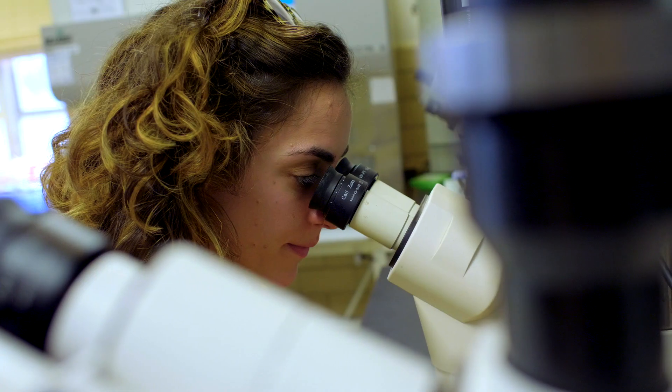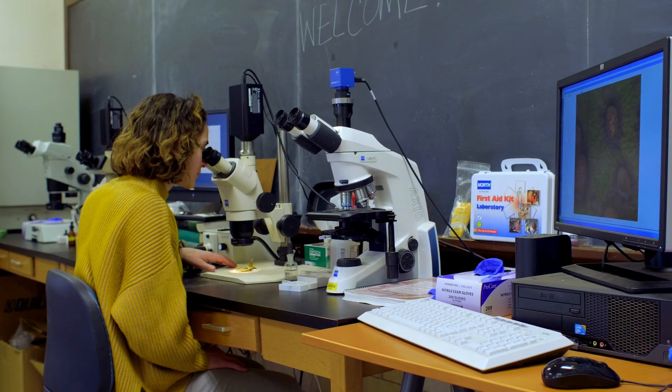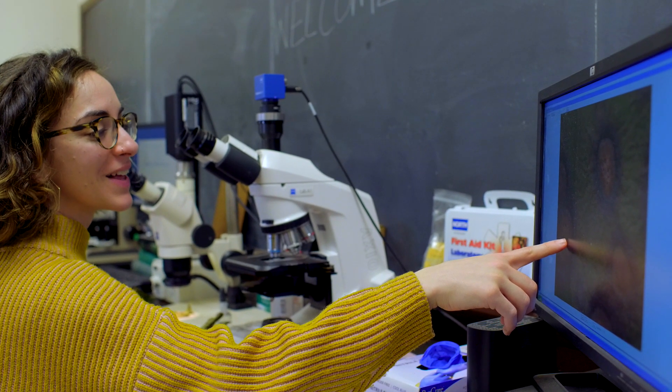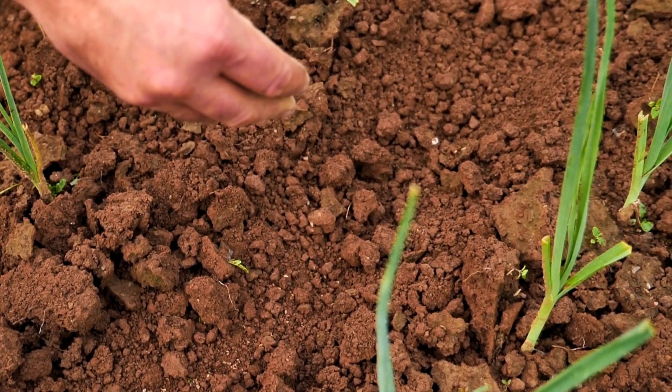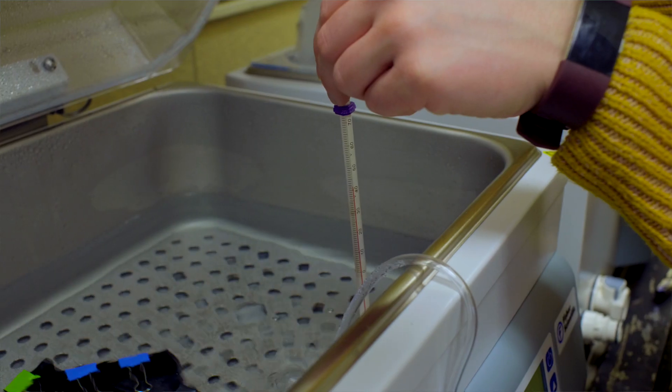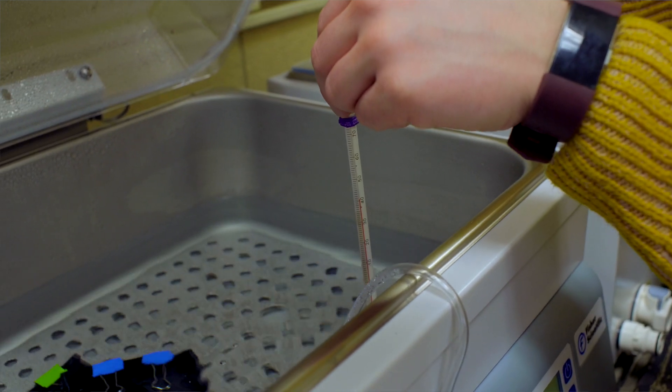We're always trying to prevent, get ahead of, or better manage plant diseases that affect us during the growing season. Treating seeds is one method to help start you off right and could help reduce chemical inputs used later in the season. Hot water seed treatment is a new and innovative service we're offering here at the UConn Plant Diagnostic Lab for vegetable and herb crops.